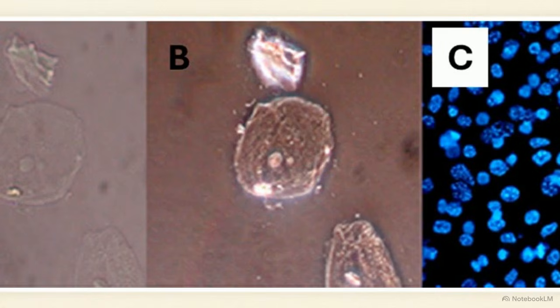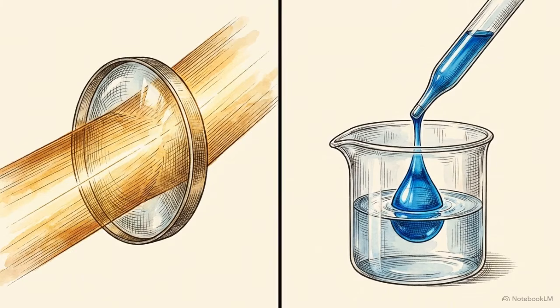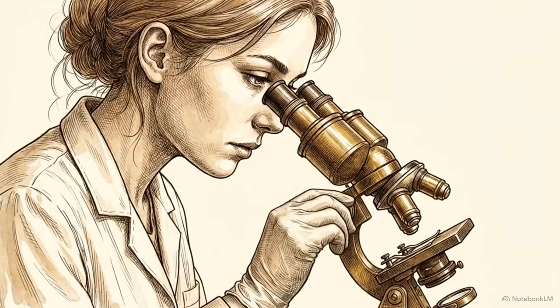Modern preparation has evolved even further. Phase contrast techniques let researchers view living cells in their natural state without harsh chemicals. Fluorescence microscopy uses high-intensity light to make specific cellular targets glow brightly against a dark background, revealing hidden structures. Peering into the cellular world is a delicate partnership. It requires mastering optical physics to manipulate light and precise human chemistry to prepare the sample to receive it.